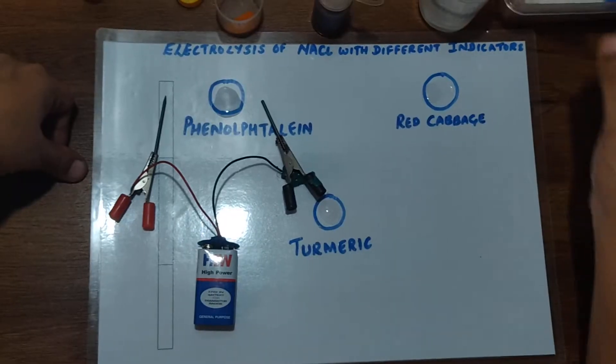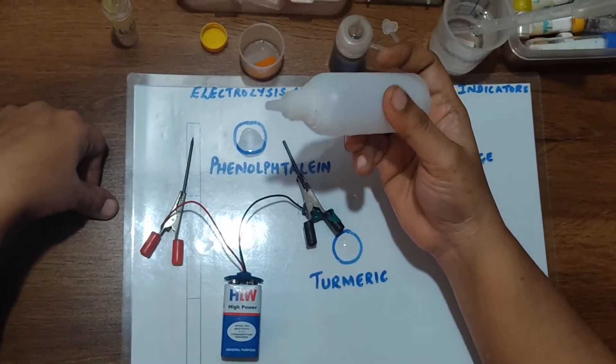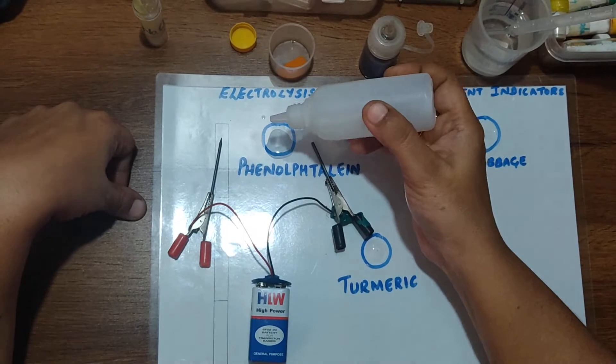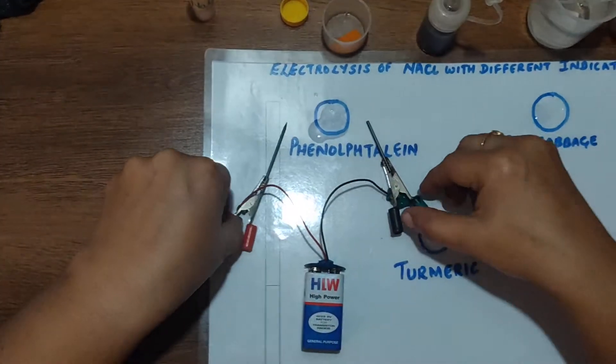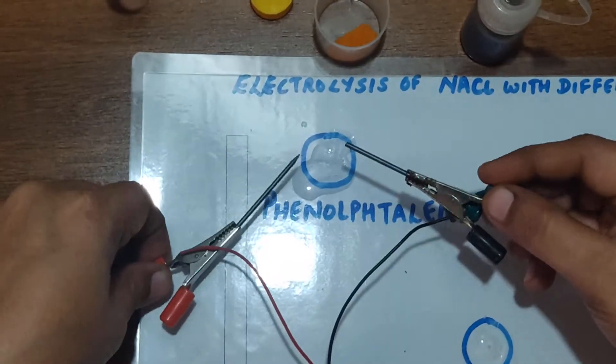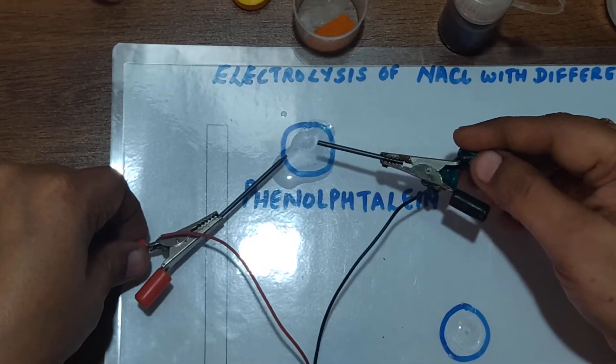Now I'm going to add in the first circle a drop of phenolphthalein, and let me just put the graphite rods. Make sure they don't touch each other.